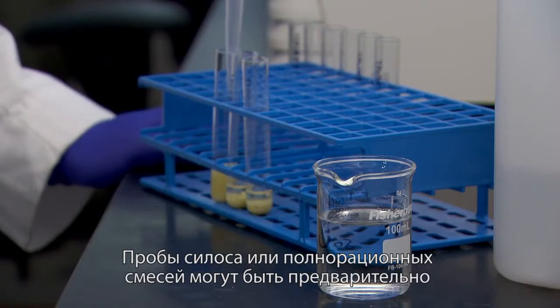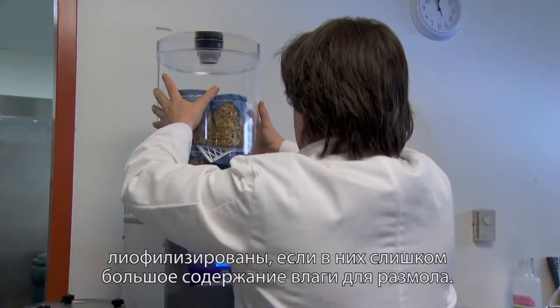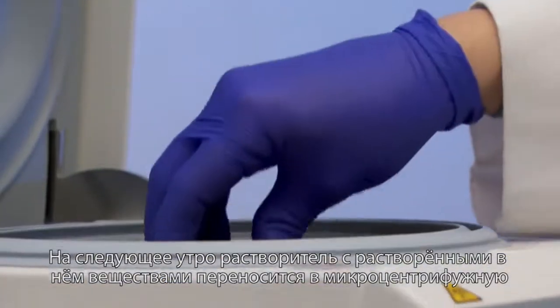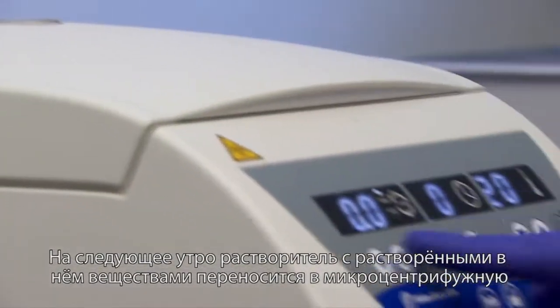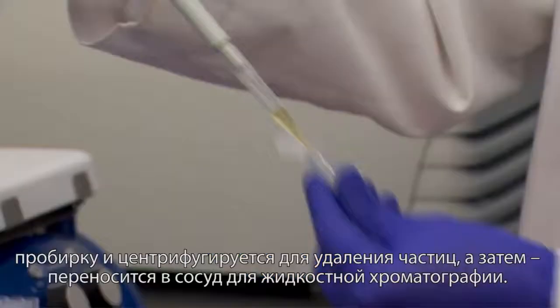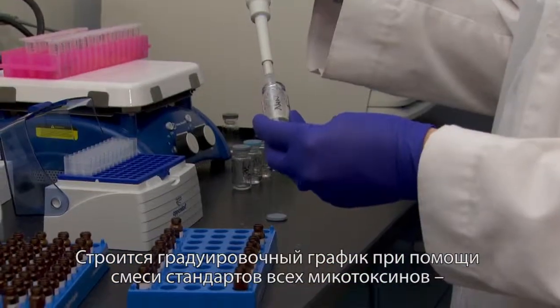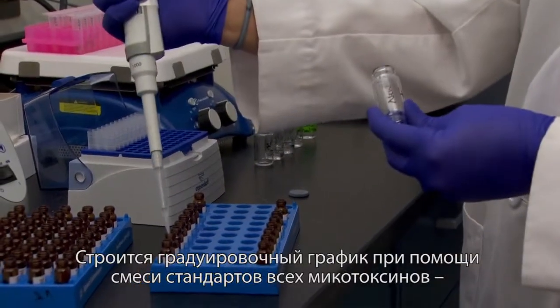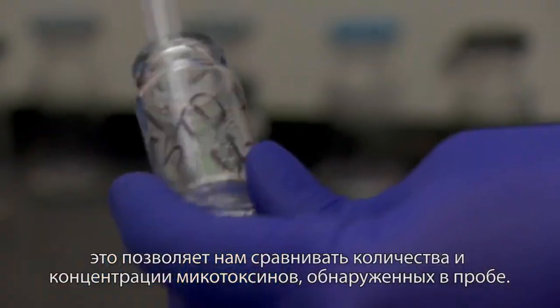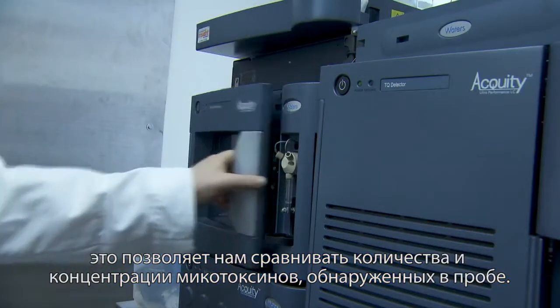Samples such as silages or TMRs may have to be freeze-dried if they're too wet to grind. The following morning, post-extraction solvent is transferred to a microcentrifuge tube and spun down to eliminate particulate matter, then transferred to an LC vial. A calibration curve is created from a mixture of standards of all mycotoxins. This allows us to compare and quantify the concentration of mycotoxins found in the sample.